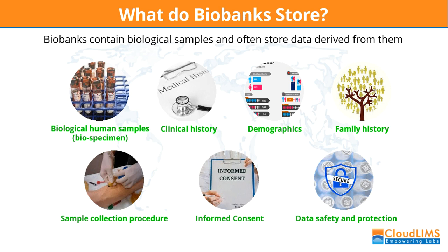We'll look at what sample collection procedures were used, so we can infer the history of the sample and how it was actually provided to us, and how the processing might have affected the sample and what particular use it could be, depending on the processing that it's undergone. We'll also, importantly, to comply with regulations, have information on informed consent.